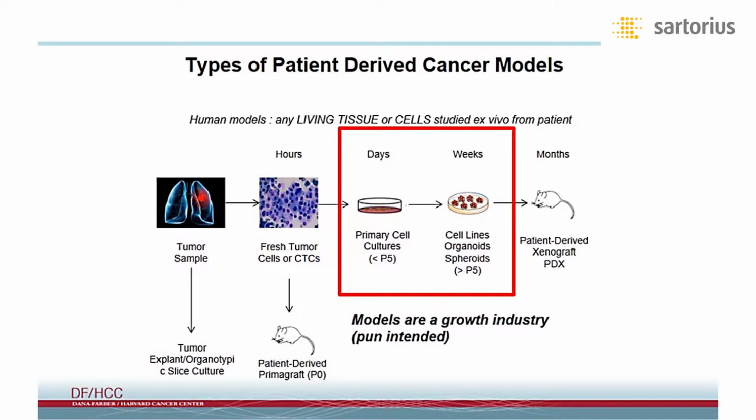There's many different terminologies for this, but the key being that the three-dimensional structure of the organoids or spheroids in brain tumors, as well as in other cancers, as was stated earlier, is felt to really help maintain many of the key properties both for science as well as for clinical translation of scientific findings into better treatments for patients.